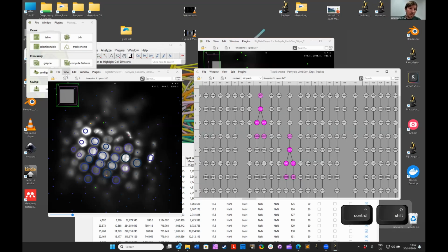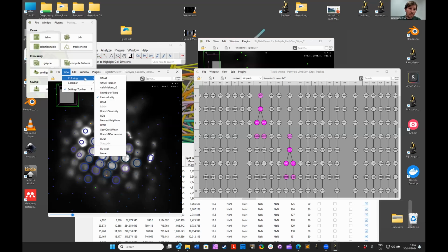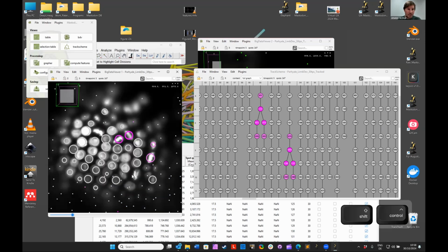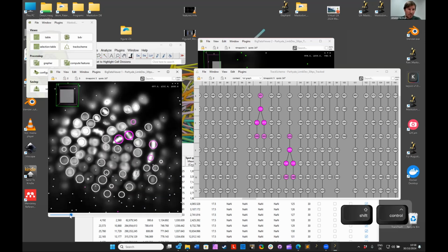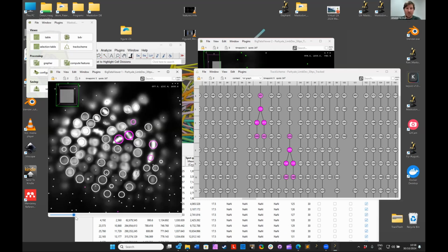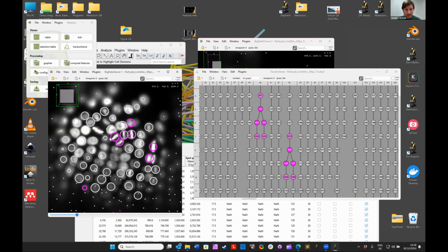And if I go here to the BigDataViewer window, I can also go to the cell divisions version 2. And you can see here that indeed it found cell divisions and automatically highlighted them for you. And in this way, you can also look for mistakes to then correct, for maybe cell divisions that are wrong or badly detected.